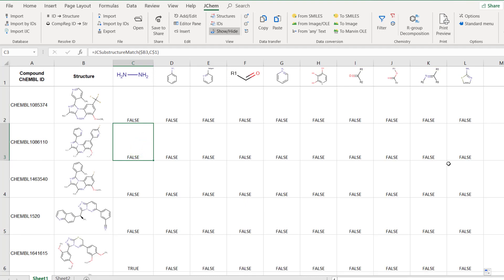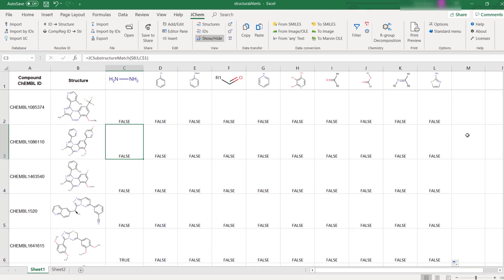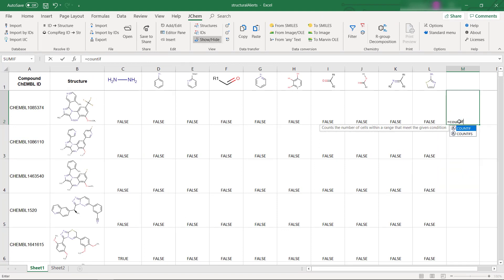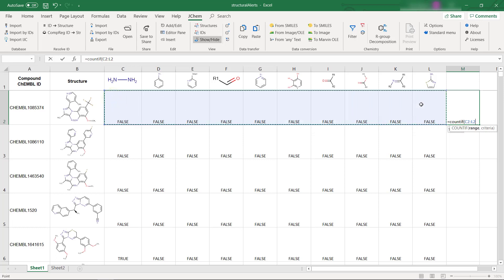In order to see which compounds match with several alerts, use the COUNTIF function of Excel in a new column. Use the function in the first row which counts the occurrence of true values.